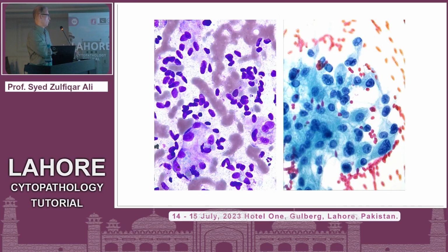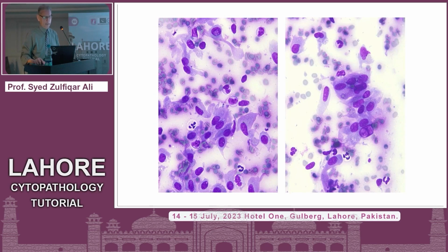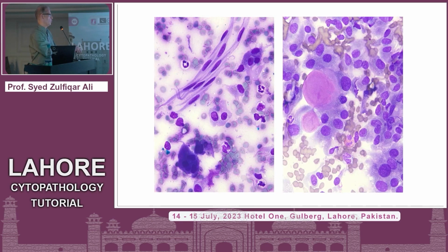And those of you who have seen it in cytology before, they are rich in sustentacular cells, and they also have intranuclear inclusions, just like hyalinizing trabecular tumor. There are other examples of HTA from our collection. They can have cytoplasmic tails, beautiful intranuclear inclusions, again, glittering like gold. And that's why they trick you. They can be very spindly.